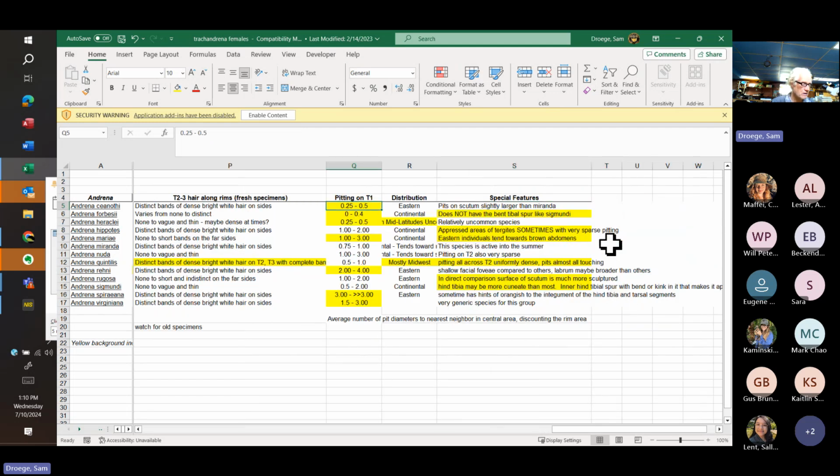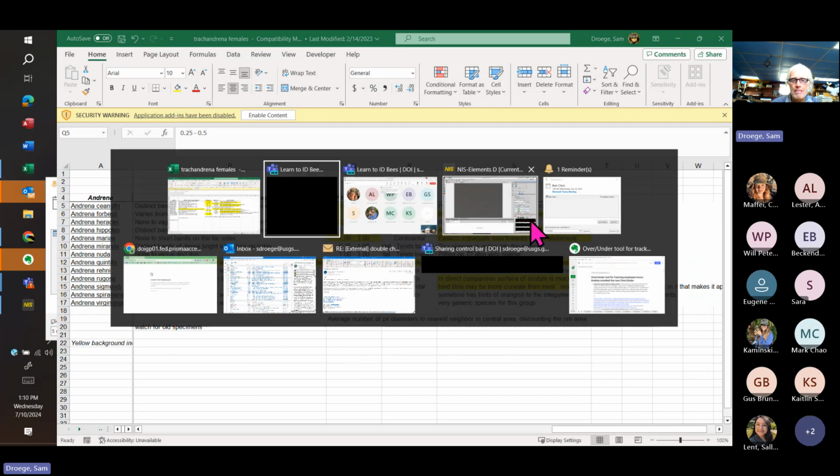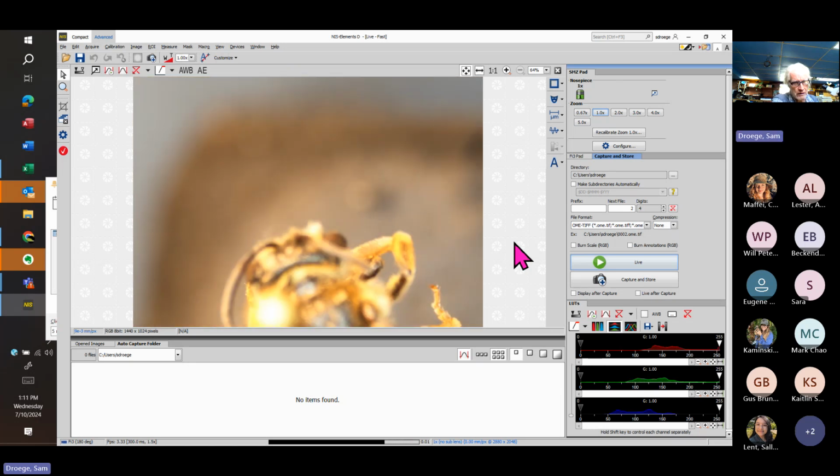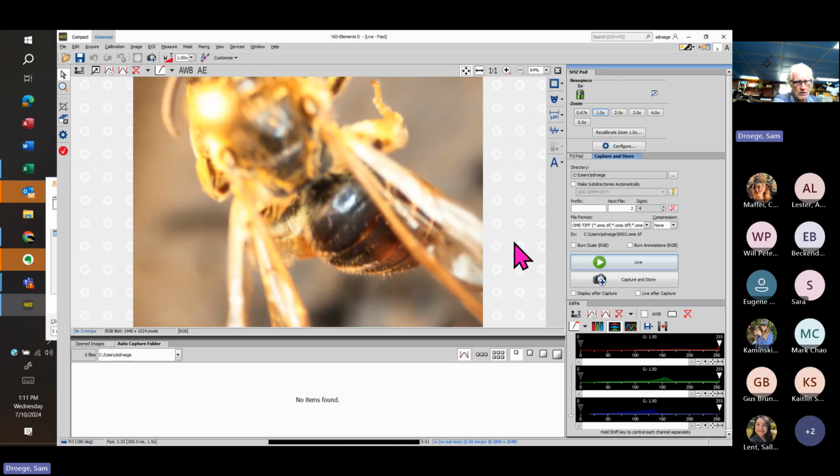All right, let's take a look at one, in this case from West Virginia, at a higher elevation. We really don't see this much in Maryland, except in Western Maryland. And we will go here and bring the level down. First, we'll look at some general things on this.